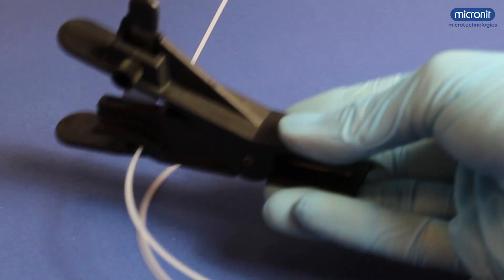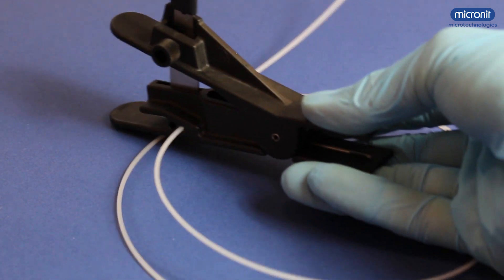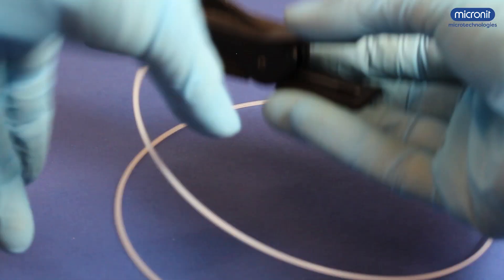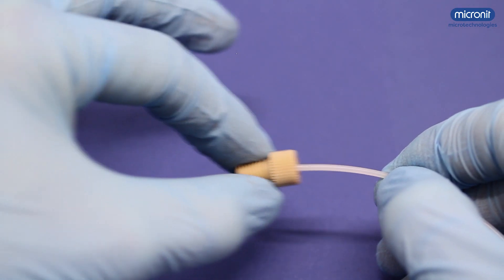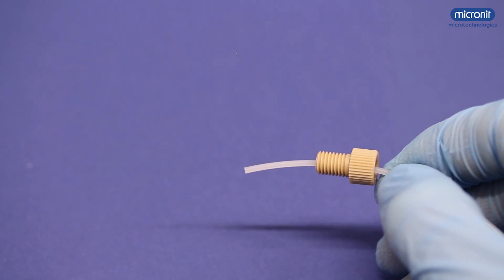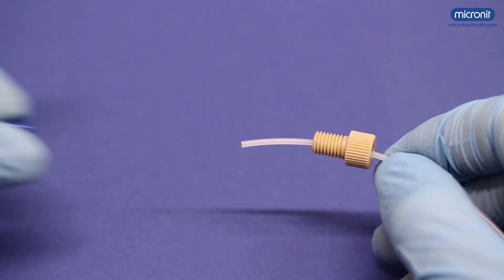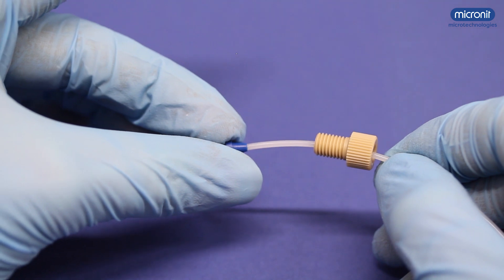Take the thinner tubing and cut it to pieces long enough to reach between components of your setup. Don't make them too long, because the pressure drops with each centimeter of tubing. To connect the tubing to the fluid reservoirs, string the correct parts on the tubing. Also pay attention to having them in the right direction.